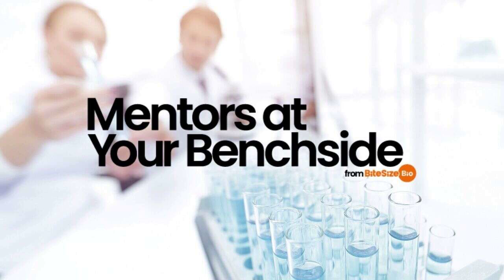So what specifically can you stain using H&E stain? Hematoxylin stains cell nuclei and ribosomes blue or purple. Eosin stains the cytoplasm, collagen, and the extracellular matrix shades of pink or red. Because an H&E stain is ionic, it's poor at staining most neutral components, including lipids, glycogen, and mucus.